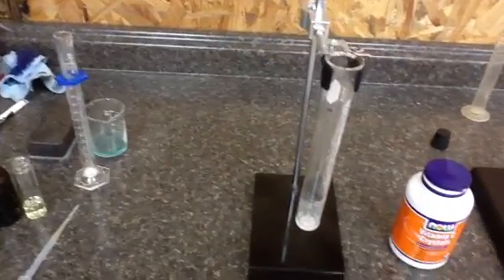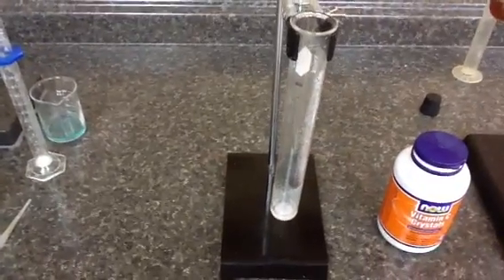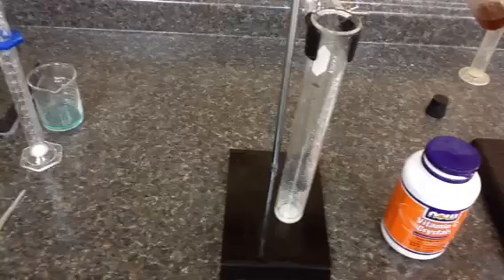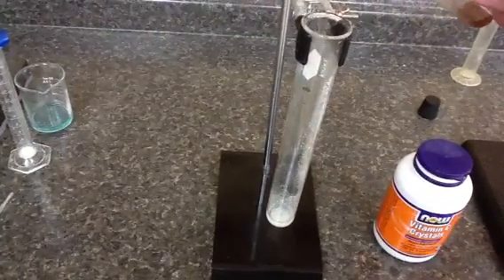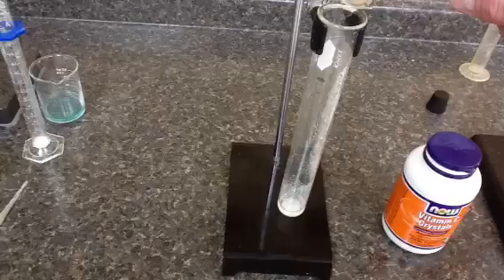I'm going to add to this solution approximately 1 cc of iron in liquid form, already suspended in the solution, and observe what happens.